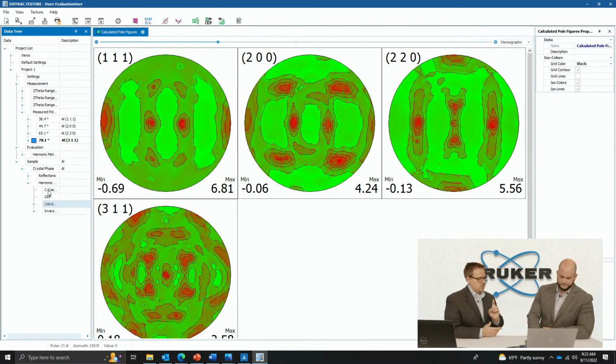So now we're going to go to the component method. That's the one. So that's right up here again, we come back home. This is like your home base, so we don't have to start over from scratch. We don't have to import the data again, we're just adding it over into the data tree. It's intelligent enough to know that we're going to use the same data.